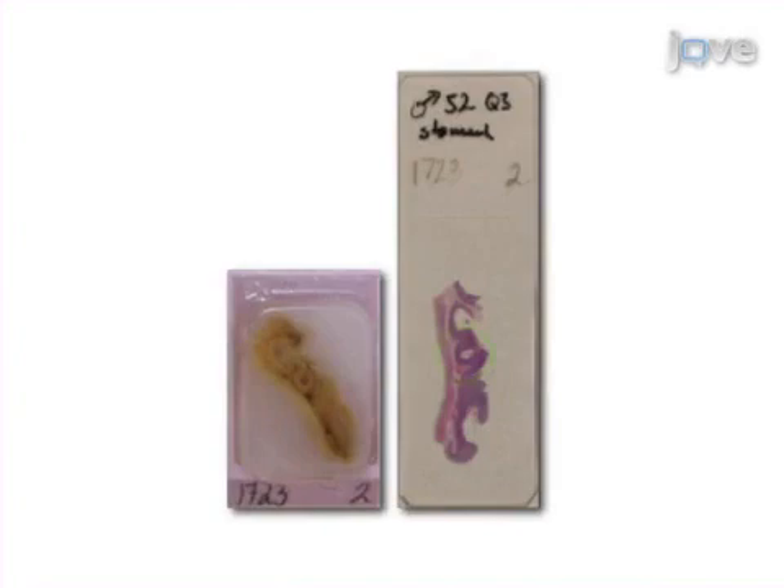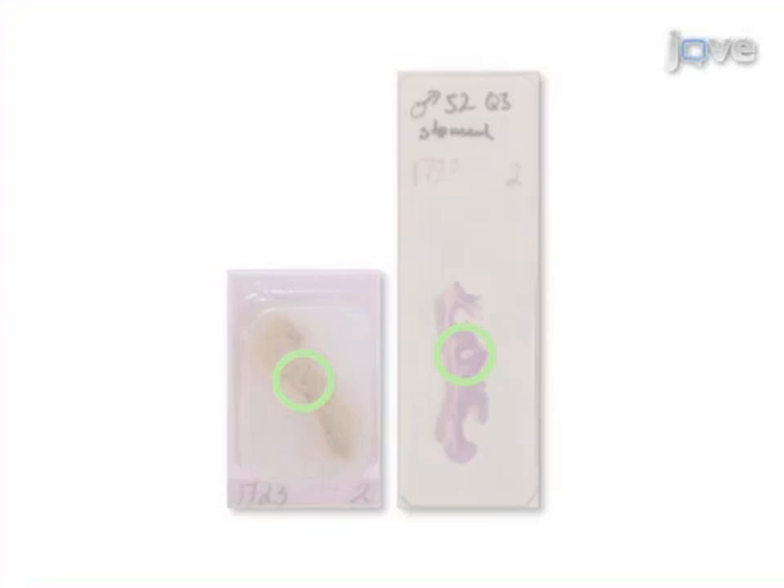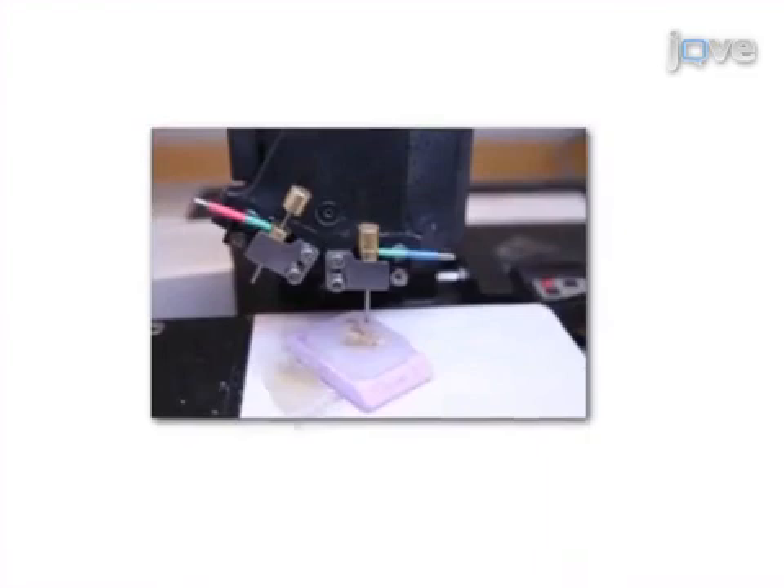This is accomplished by first selecting representative areas of formalin fixed paraffin embedded tissues. Next, marked areas are punched and the selected cores are assembled into a single paraffin block — a tissue microarray.